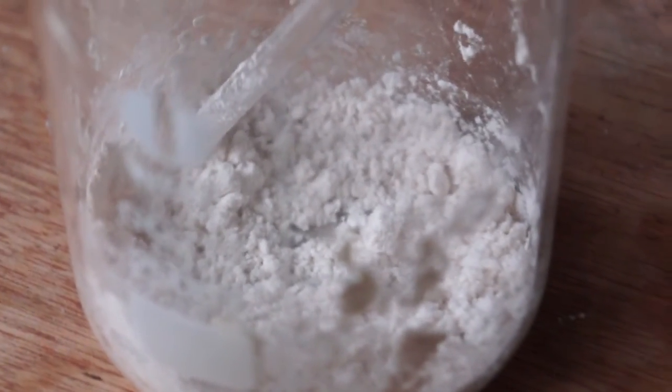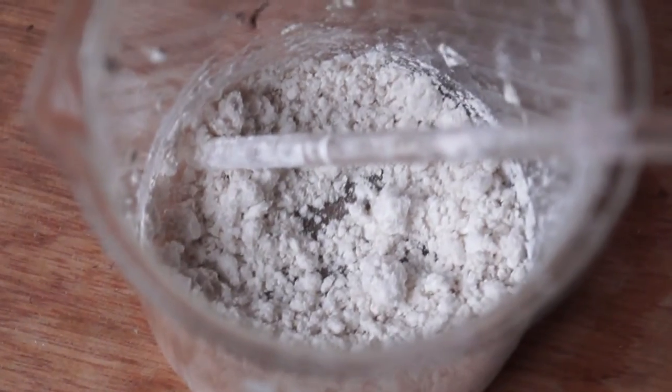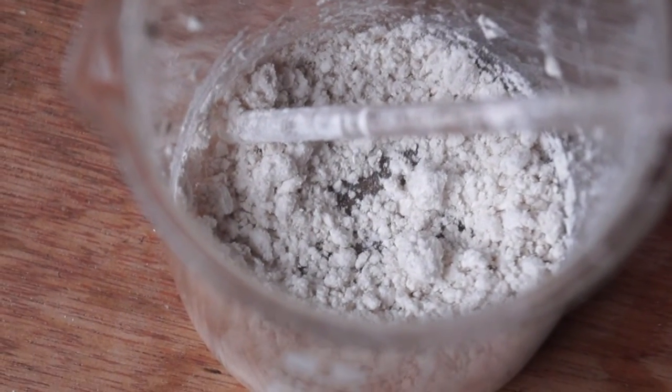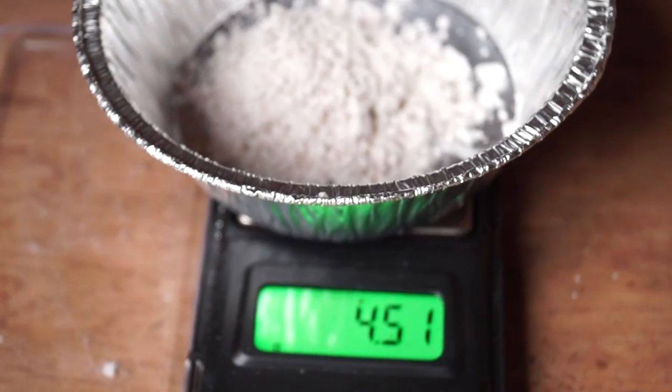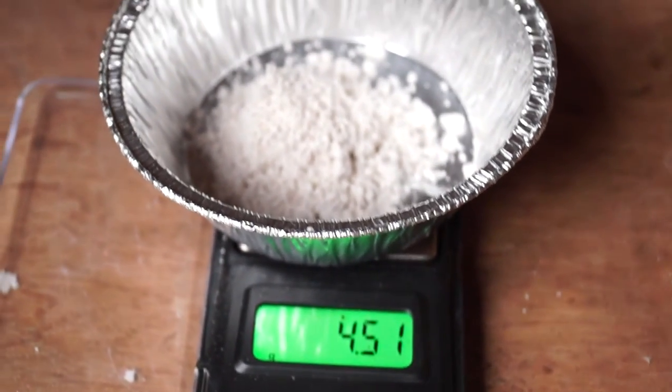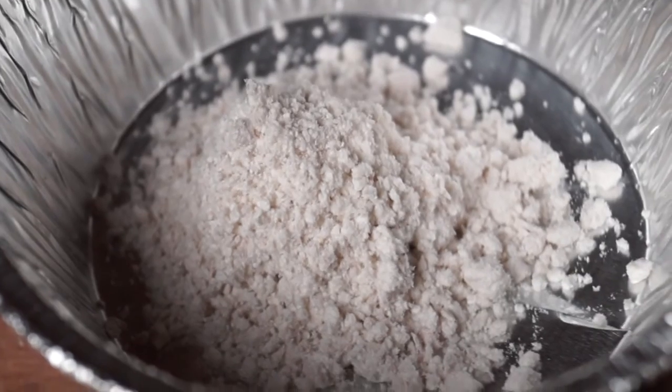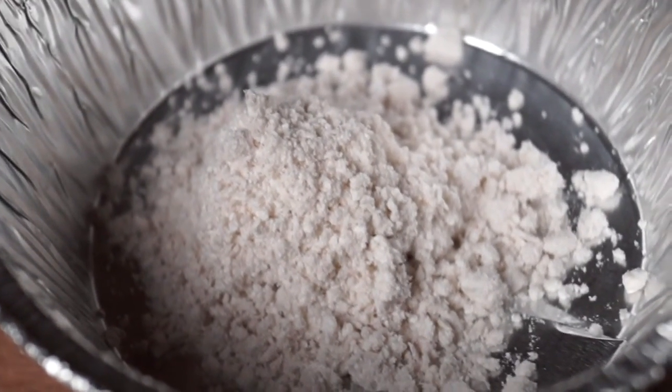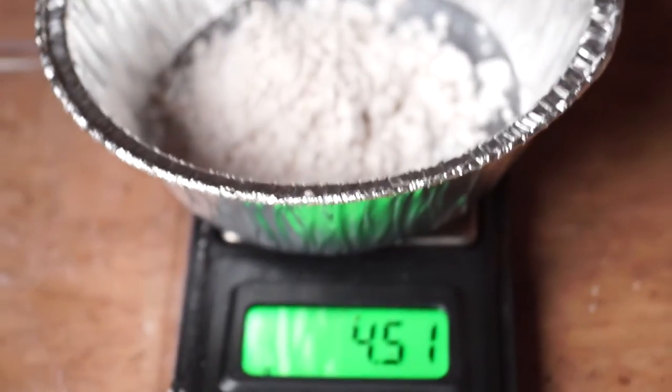I then weighed the product and found it to have a mass of 4.51 grams. This works out at a yield of 79%. This isn't something to shout about, but I believe if I was working with greater amounts of aspirin, the yield could be increased significantly. And that's how you prepare salicylic acid from aspirin tablets.